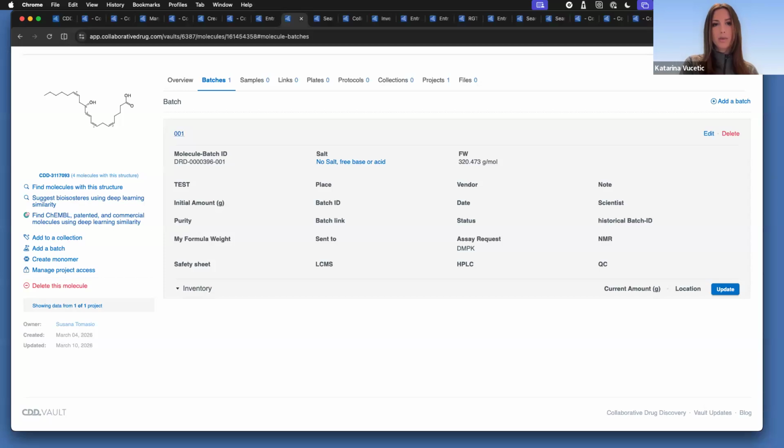In the meantime, I just want to mention that, like I said, this is widely applicable in medicinal chemistry, but I know that some of you don't work specifically in medicinal chemistry. It's also applicable in different areas of chemistry, so it would just need to be adjusted. Some fields might need to be set up differently to adjust to your workflow, but it's possible. Especially the electronic lab notebook would probably be valuable to capture all your research or experimental information.